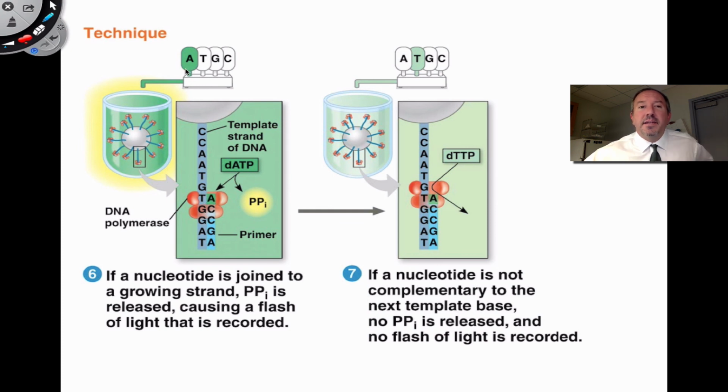So if you added this nucleotide to this and it attaches, the computer is so sensitive that, if you're familiar with sequencing, when you add a dNTP, a pyrophosphate is removed during the synthesis, because 2 of the phosphates need to be removed to provide the energy necessary to catalyze the phosphodiester bond of the new phosphate group to the sugar.